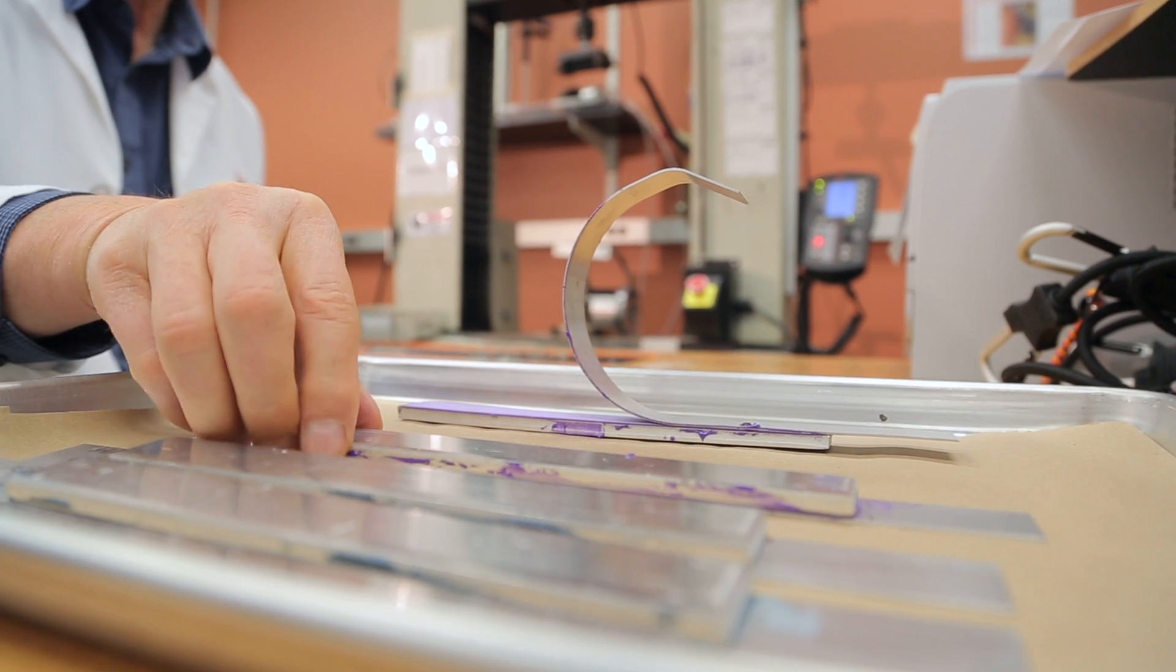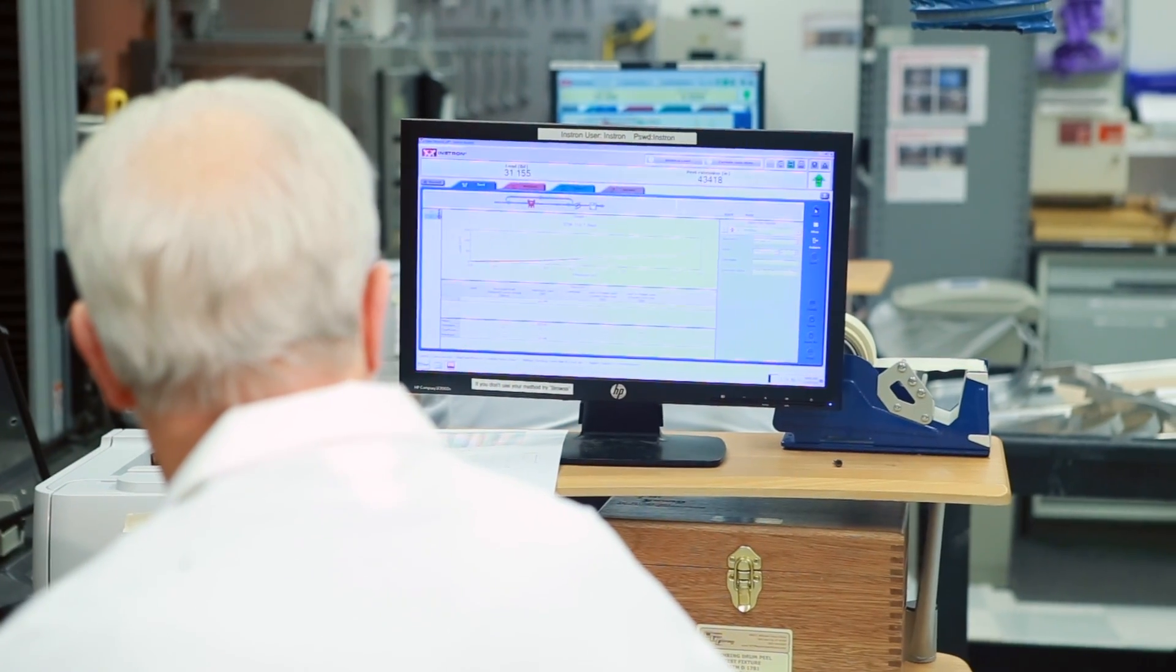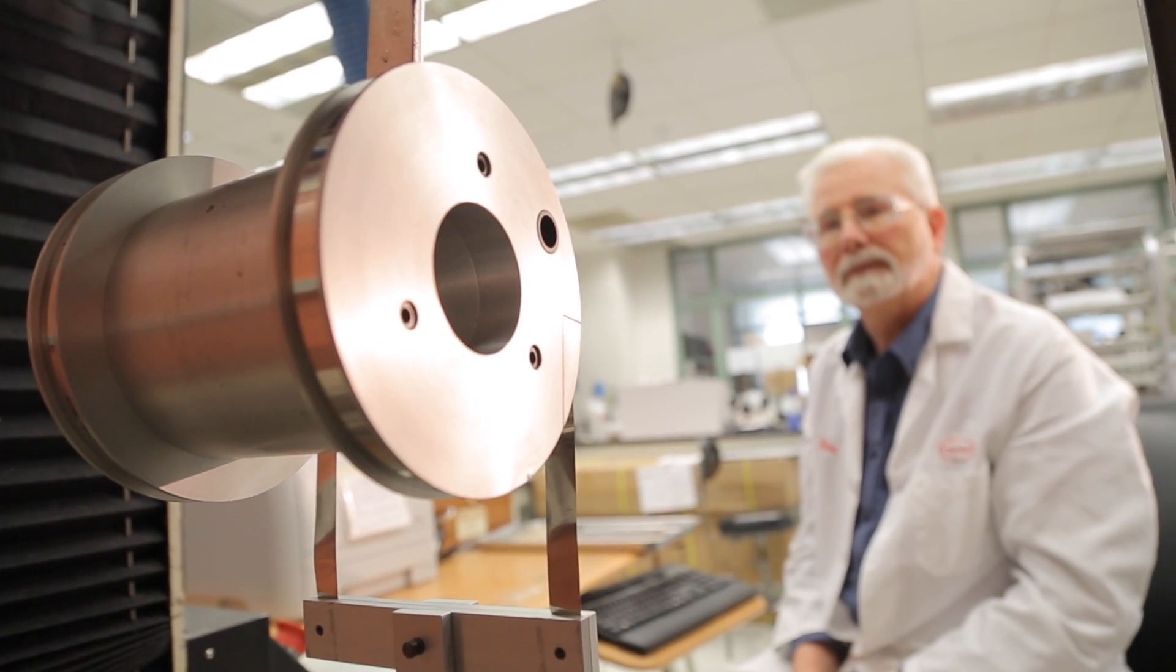When designing a bonded assembly, these loads should be avoided as much as possible. One method, called the climbing drum peel test, allows for calculation of an adhesive's peel strength independent of the substrate it is bonded to.